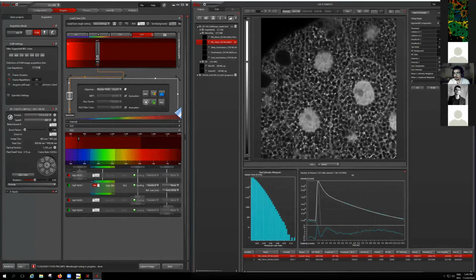And yes, when it goes to the pixels, there are suggestions, from simulations and measurements, saying that you need about 100 photons if you have a mono-exponential decay curve to fit. If you have two components, that goes higher, to about 2,000 or more. So there are recommendations in the range of 1,000 to 10,000. On another system that we had, I was using 2,000 counts for the brightest pixel.